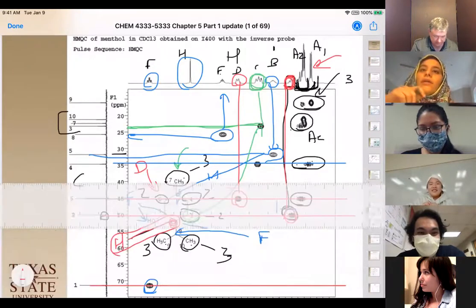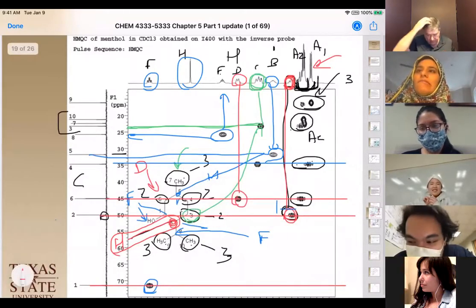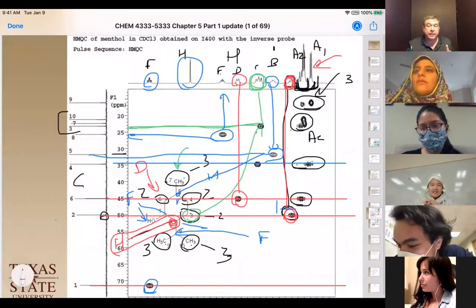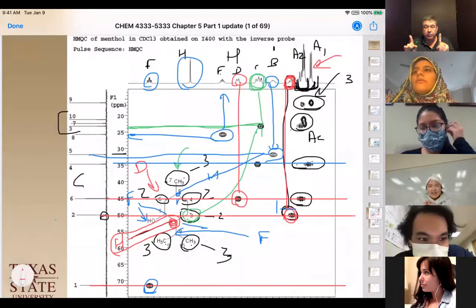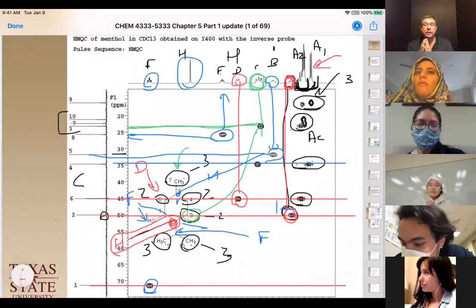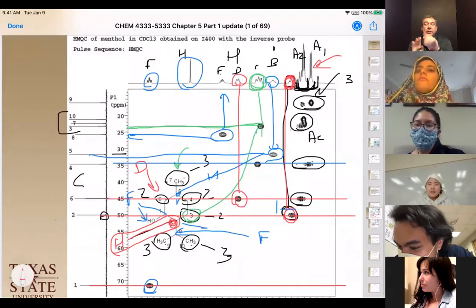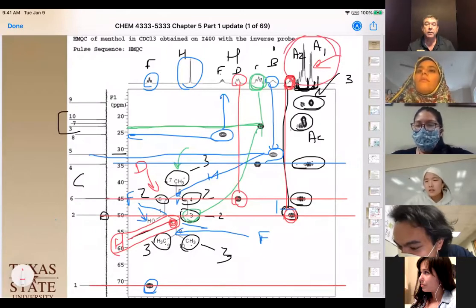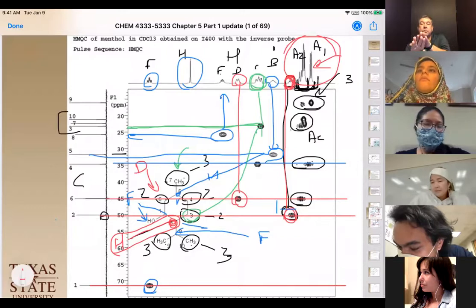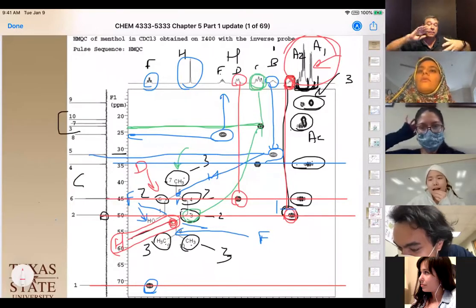I have a question. Why is the single carbon showing two signals, like carbon 4 and carbon 6? Okay, so part of that could be that there's a big enough coupling constant that it's showing up in two places. Let's say you have a big coupling constant of maybe 10 or 12, so you're actually split into two peaks, but because we can't identify individual peaks here, we don't have peak to peak separation. We could have a doublet of doublets laid on top of a triplet, laid on top of a quartet, and we just wouldn't be able to differentiate them in the proton. This happens a lot, especially in rings, because we're kind of fixed in space.